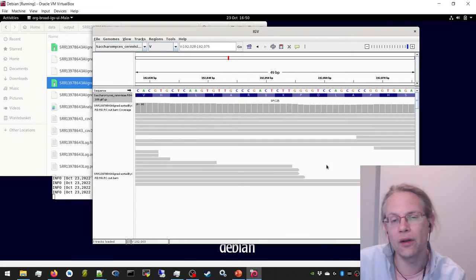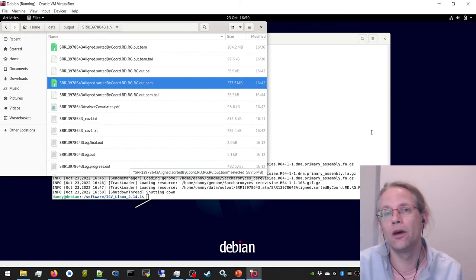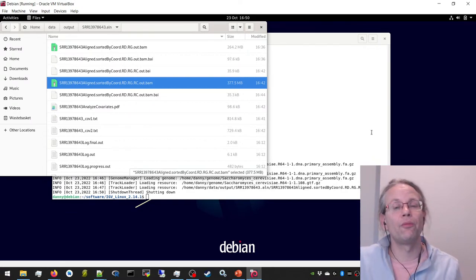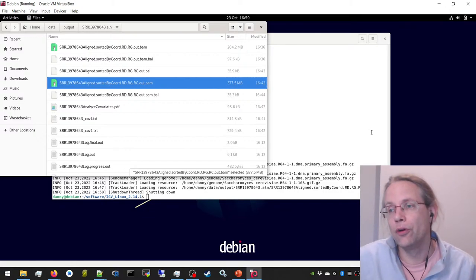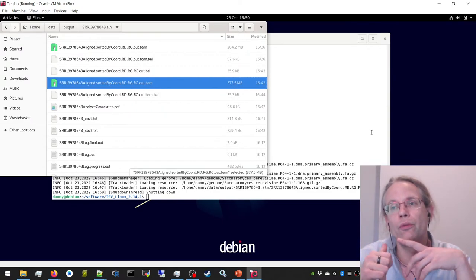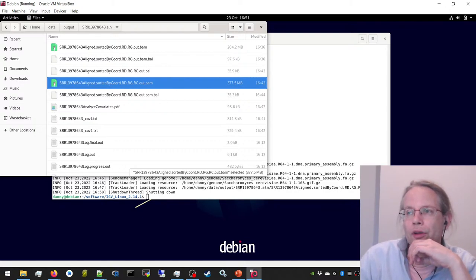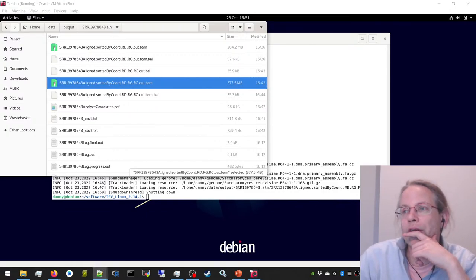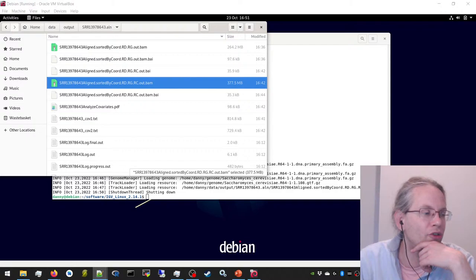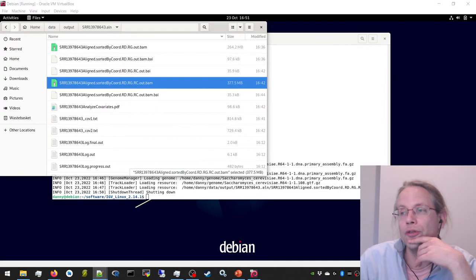Good, so that was everything that I wanted to show you guys for today, because we've been streaming for 2 hours. The script is on GitHub as a gist, so you can get the script from there. We went through the whole script step by step, right? So in the end, we have 6 different steps. We do read trimming, we do alignment. After alignment, we execute some tools to get some basic statistics. We did the duplicate removal using the Picard tool, which removes optical duplicates as well as PCR duplicates.